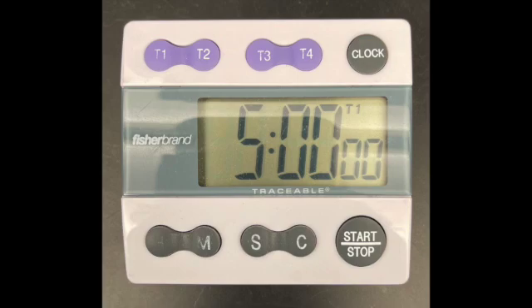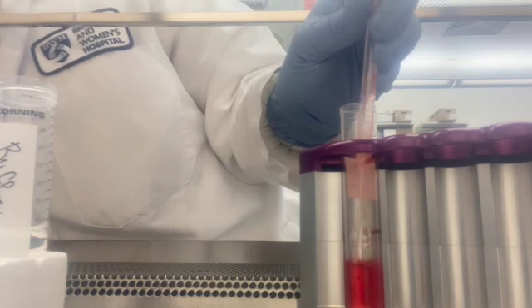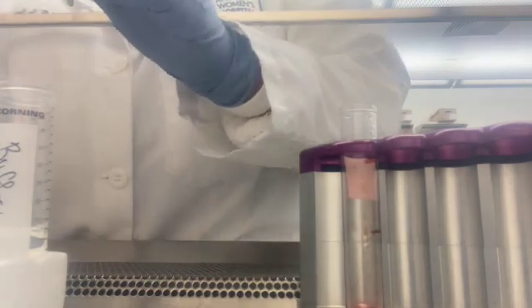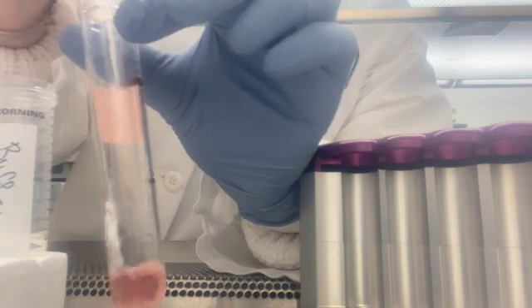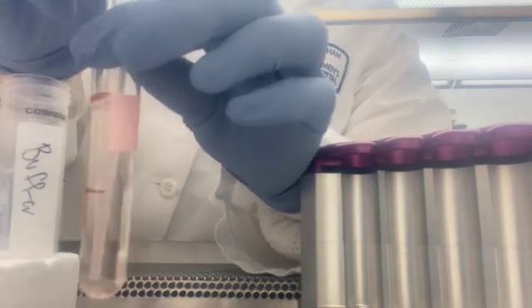Set your timer for 5 minutes. Repeating the previous step, place a clean pipette onto the aspirator and gently take off the supernatant. This time you want to go to the bottom of the tube, taking off almost all the supernatant and any clotted material. Take the tube out of the magnet. Add buffer up to the desired volume, rinsing the cells. Gently mix and then place the tube back into the magnet.